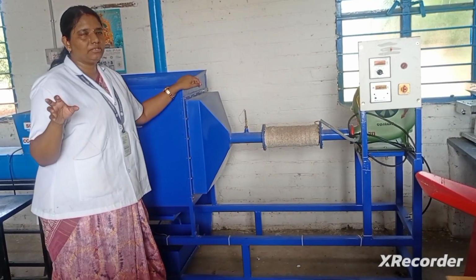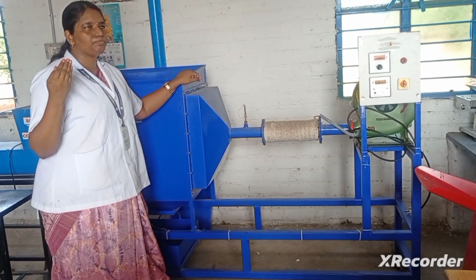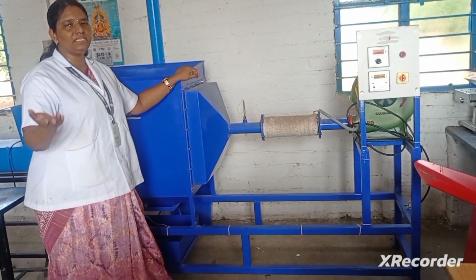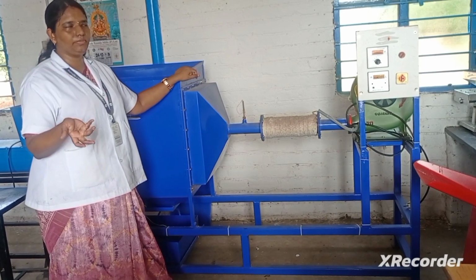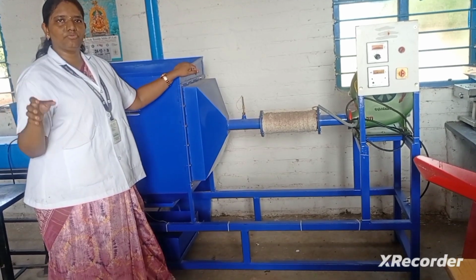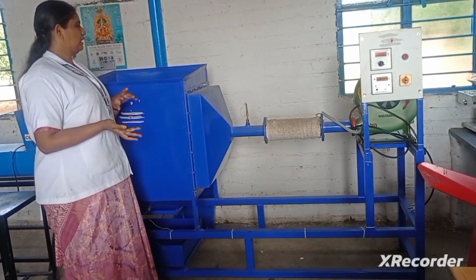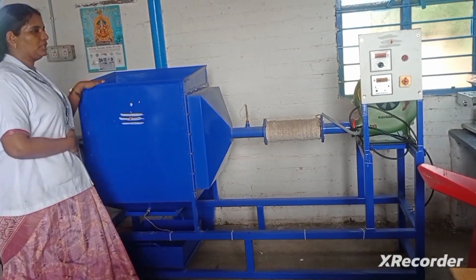After that 1 hour, we have to calculate the initial moisture content. For the initial calculation, we can just calculate initial weight minus final weight, and the answer will be the initial moisture content of the taken sample. Okay. Afterwards, we can start the procedure.